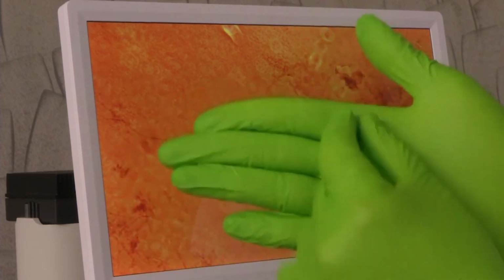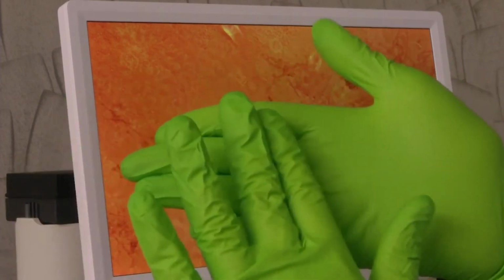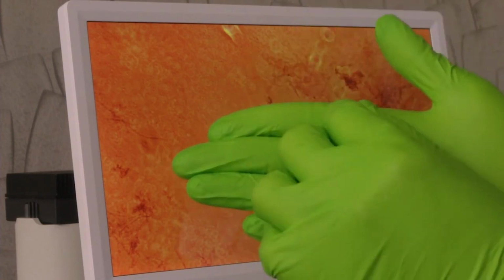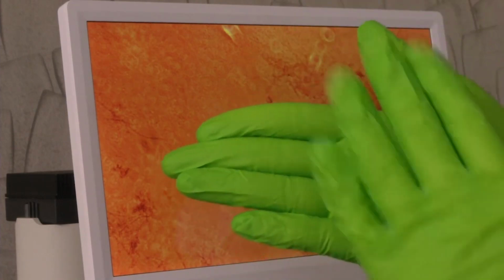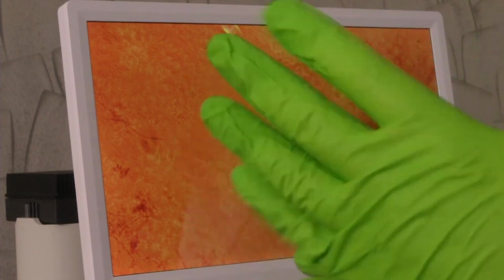Then what will people do? People will take the dish and at the bottom of the dish they will make a line, it is called scraping. They will make a line separation, and on the left side of the line and the right side of the line they will provide a matrix kind of structure allowing for the cells to move, but in the middle there won't be anything. Then the cells will be grown on both sides of this divide.